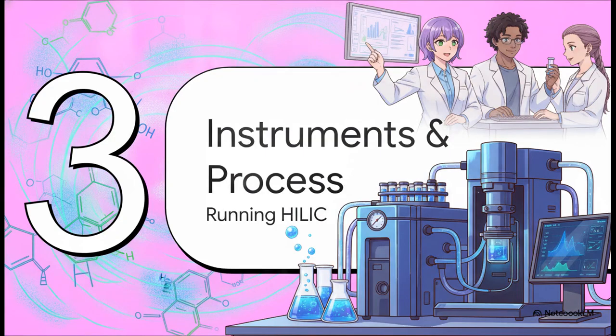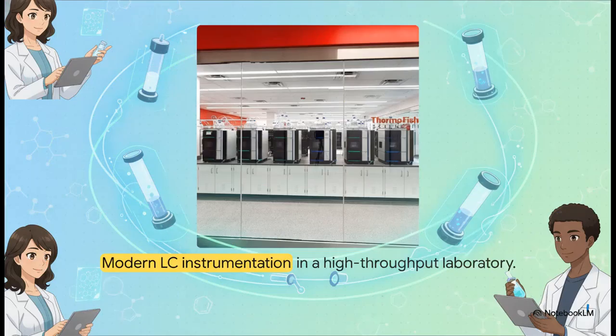Okay, that is the chemical theory. Let's switch gears to Section 3, Instrumentation and Working Process. If you're wondering how we actually run this in a real high-throughput lab setting, I've got great news. You don't need to buy a whole new fleet of instruments.